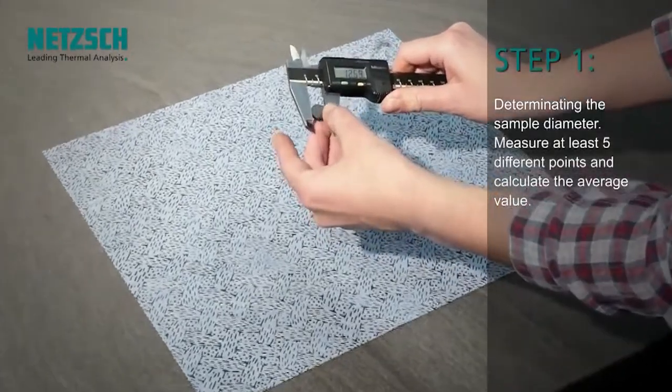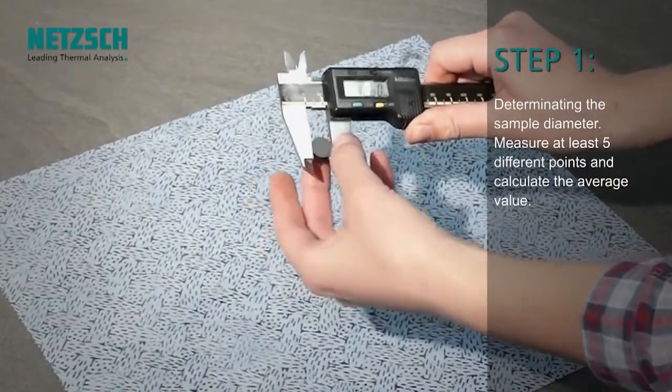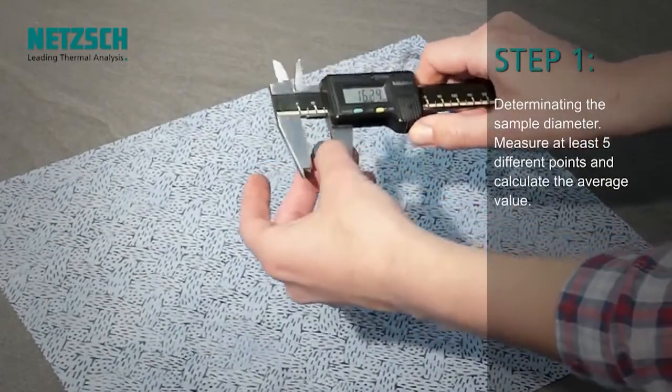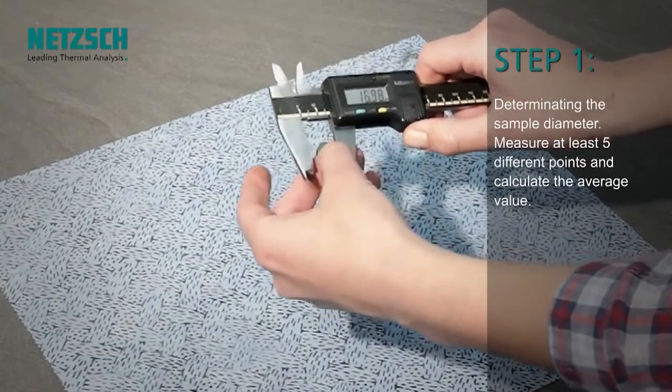Now determine the diameter of the sample. Be sure to measure at least five points of the sample and calculate the average value.